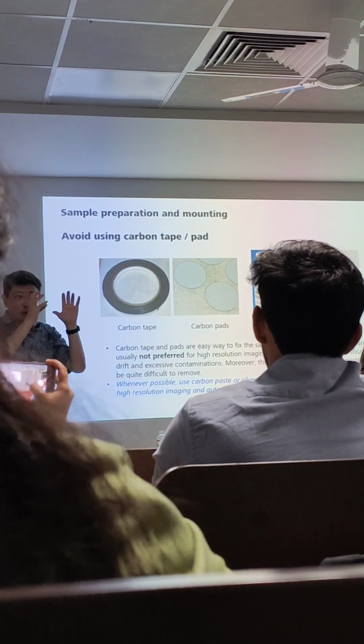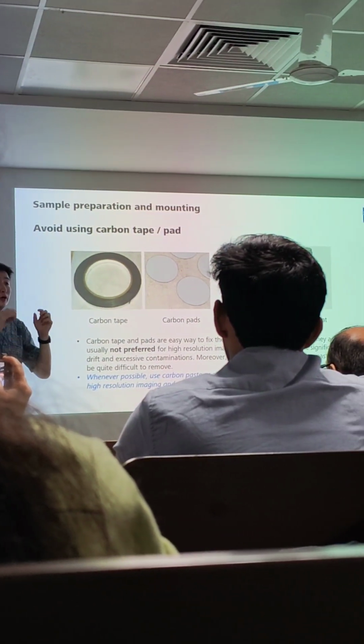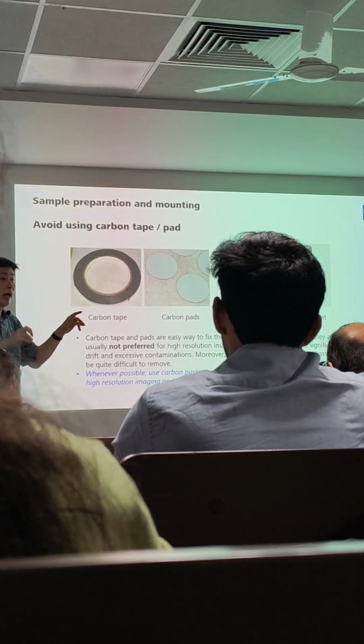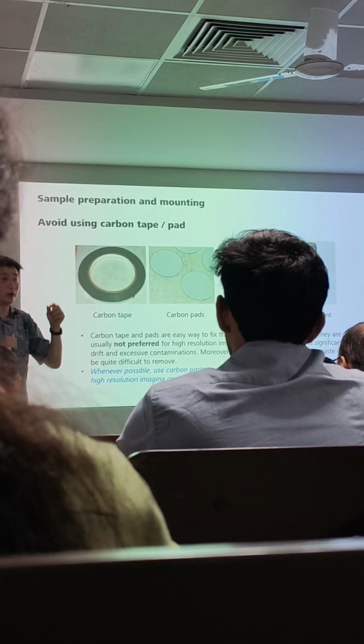When you introduce them to the sample, you must know your sample. These are not your sample. So the idea, for example, is to use as little as possible. That's the bottom line. Right? Use as little as possible.